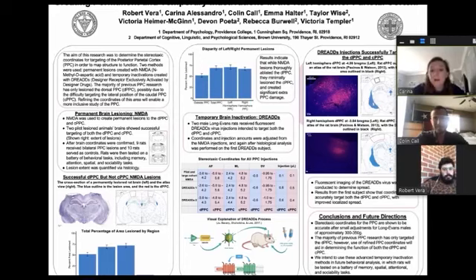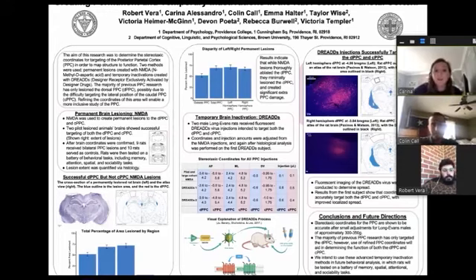So our work this semester shifted to a different brain region to perfect the DREADS method. And then we're going to move back to the PPC once we are sure that the dosage of CNO is correct, as well as if the activator CNO is the one that we should use in general.